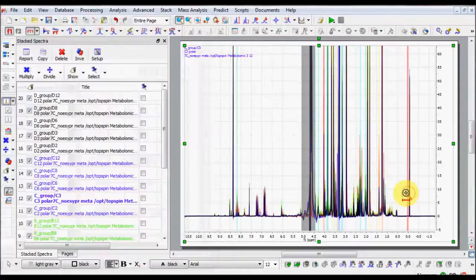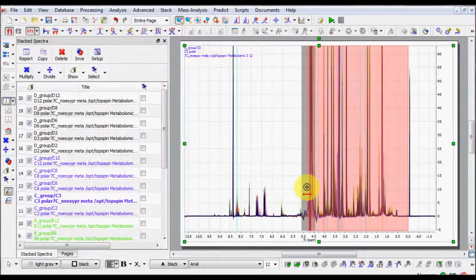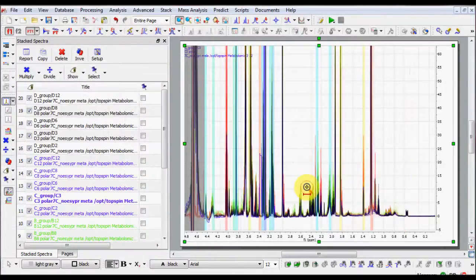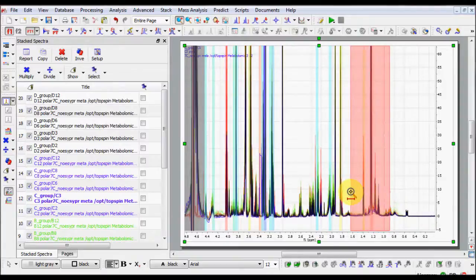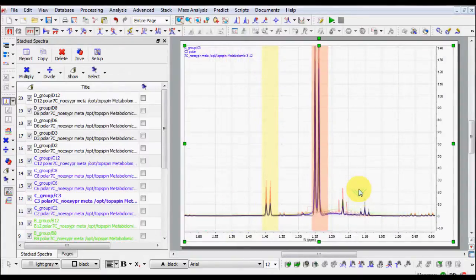Since the loadings are color-coded above the Stacked Spectra, it is now easy to identify those bins that mainly contribute to the principal component selected.